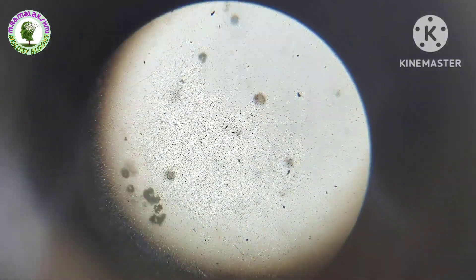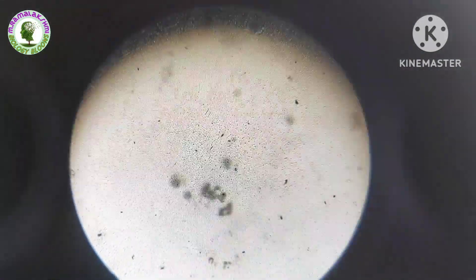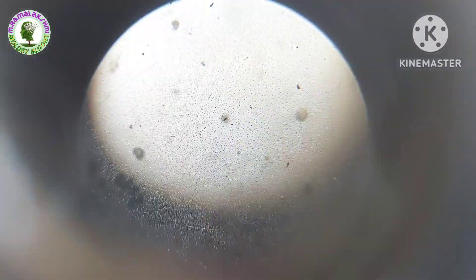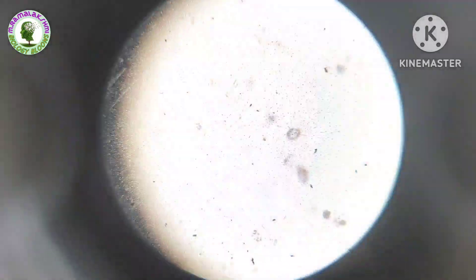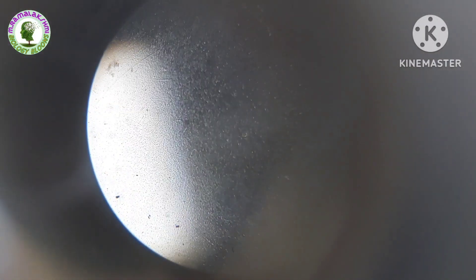The organisms which are unable to see with our naked eye are known as micro-organisms. Because they are too small to see. When we are observing under the microscope, we are able to see them. These are known as micro-organisms.